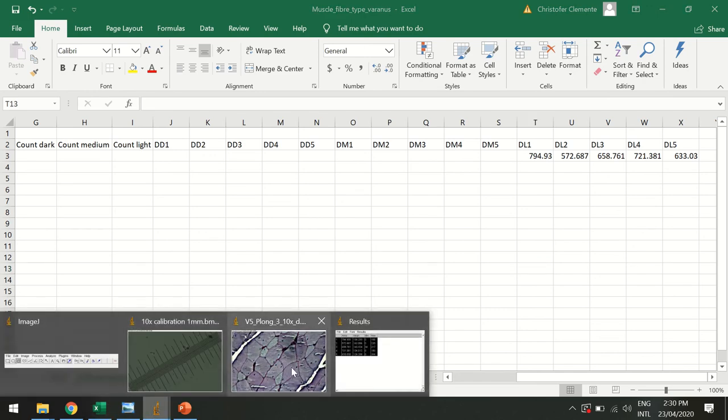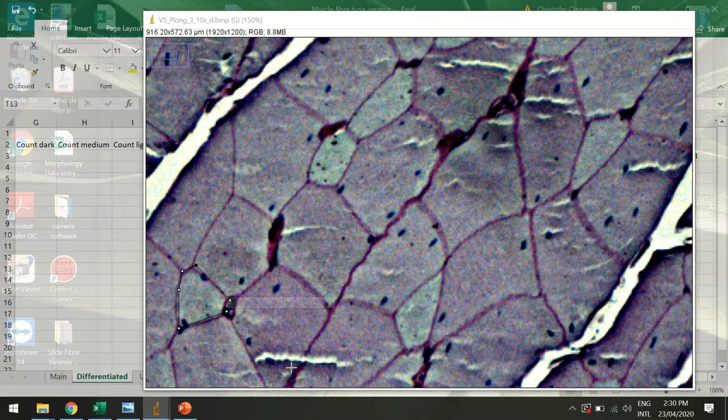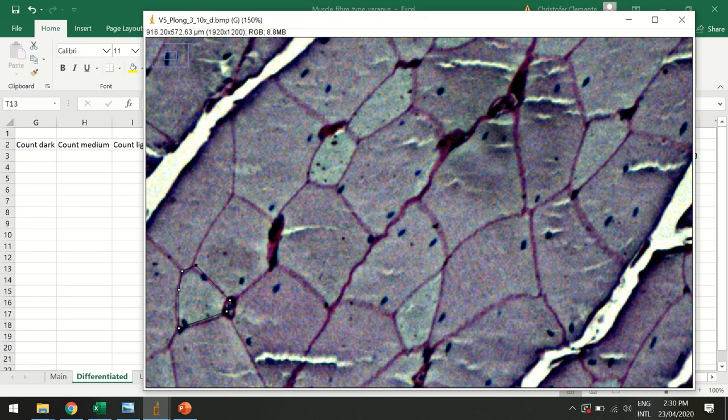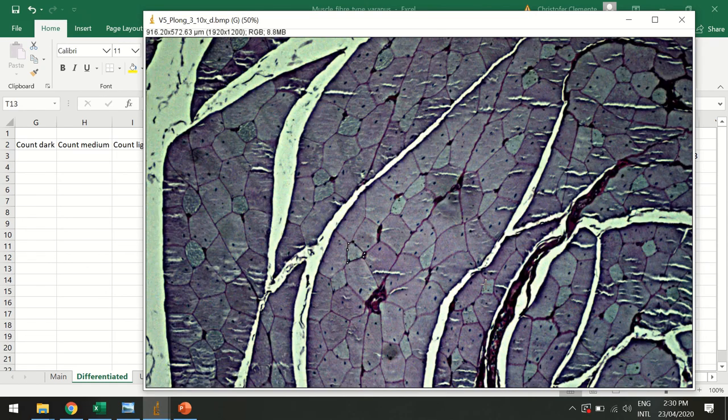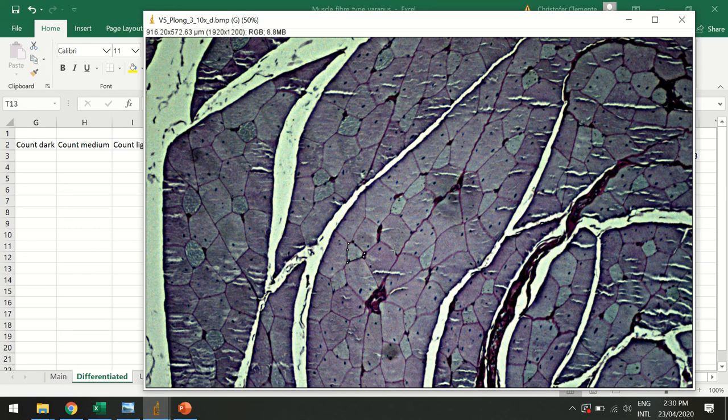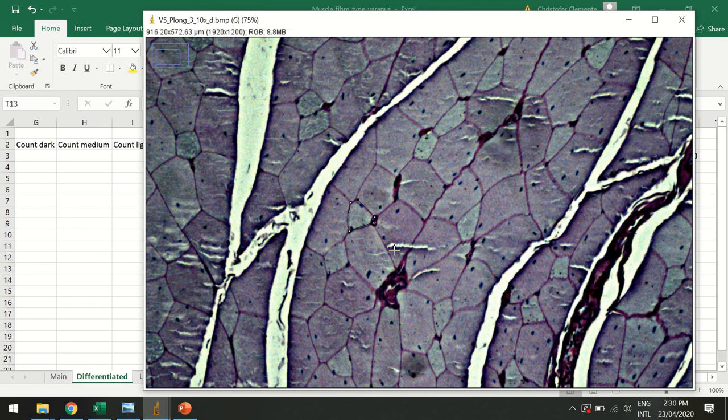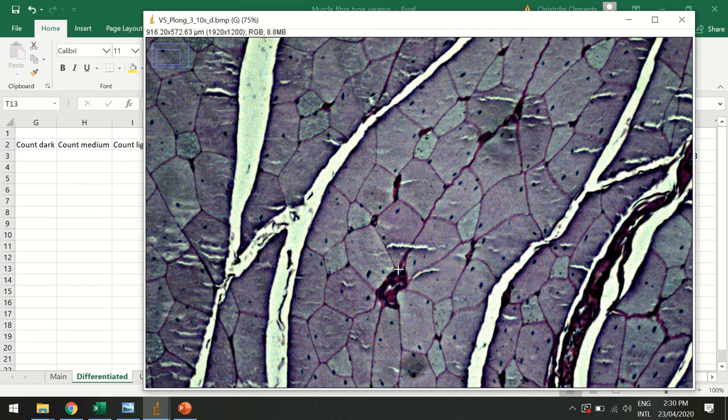Then I can go back to ImageJ and do the mediums and the darks as well. Control minus to zoom back out. And you can do them at different zoom levels and it should all be fine.